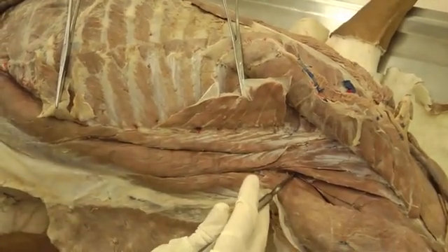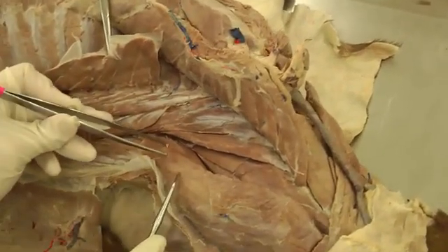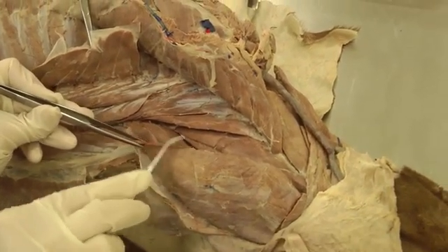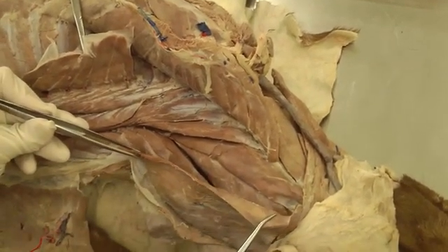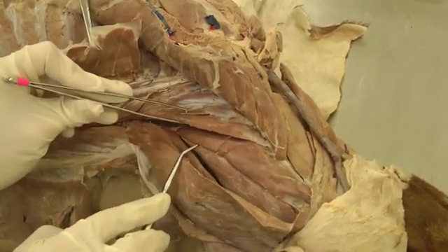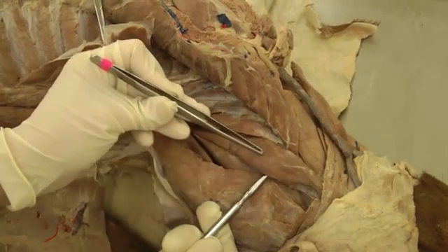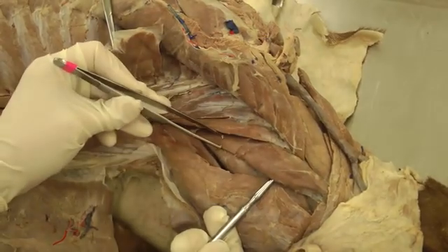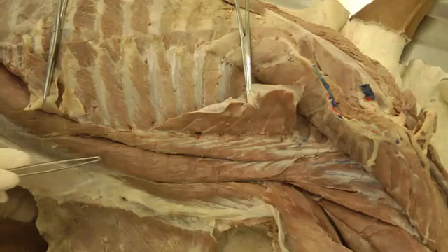In between the probe and the forceps will be the cervicis portion of longissimus. For the capitis, there's longissimus capitis — what I usually do is lift up the edge of splenius, which is part of the transversospinalis system, and then look underneath for the capitis portion of longissimus. So right here is longissimus capitis. So to summarize: longissimus capitis, longissimus cervicis, longissimus thoracis et lumborum.